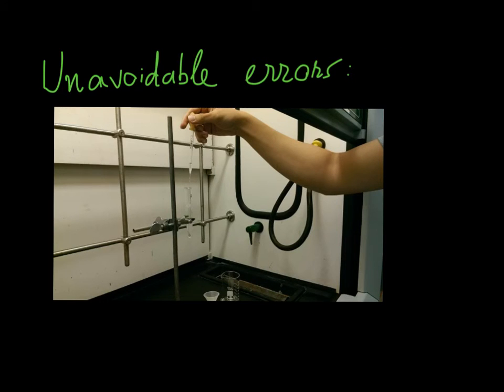One unavoidable mistake that I made in this lab was when I was using the pipette to agitate and mix the aqueous HCl and the ether layer together. Some of the acidic precipitate got stuck in the pipette and I could not get it out. So some of the solid was lost, and that made my percent recovery lower than it should have been.